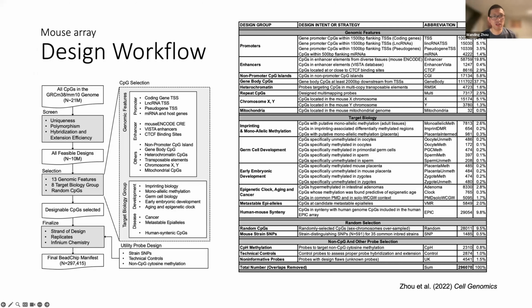Yeah. One thing that runs through my mind is that we are developing a new human array that has a more concentrated selection of human trait associations. This is going to be a smaller array, and we're definitely looking for thoughts, collaborations, ideas, or feedback. We are hoping to release this array with Illumina close to the end of the year.